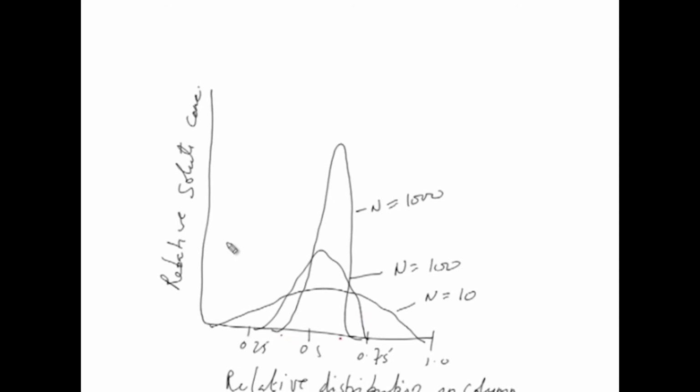It's like the solute is distributed in the column in a small area rather than in a bigger area where the theoretical plates were fewer. If the theoretical plate number is 1, then the sample just comes out in the void volume. But as the number of theoretical plates increases, the analyte also distributes itself between the stationary phase and mobile phase in very small adjacent zones, and spends more time there, and therefore you get a peak where it is present in a smaller area as compared to a larger area.